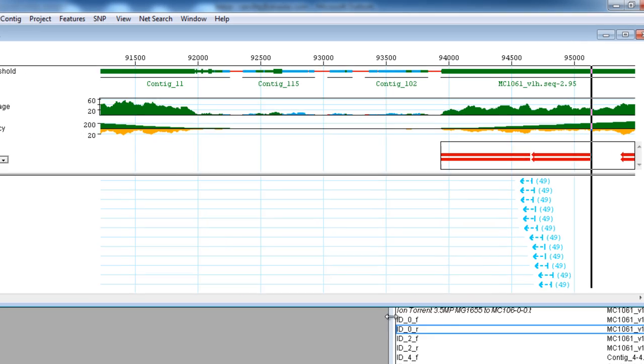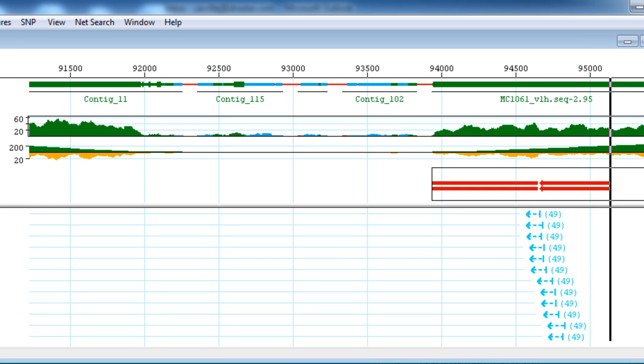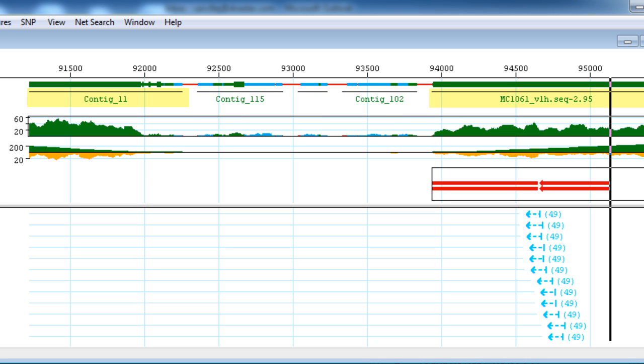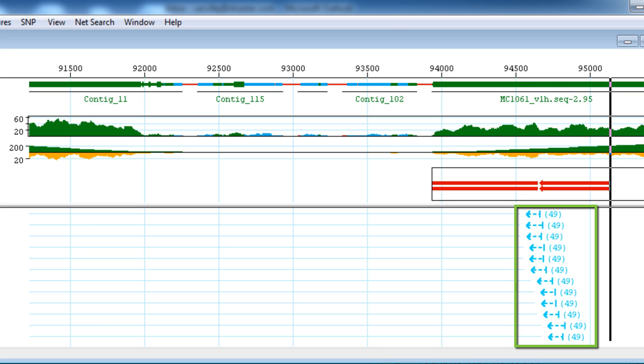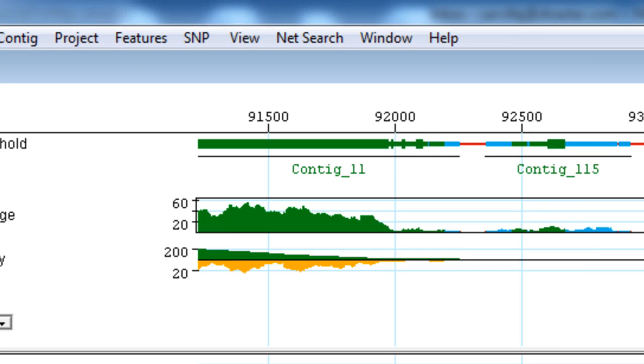If we look at the scaffold view before we align the contigs, we can clearly see 3 small contigs with very low coverage between contig 11 and this large MC1061 contig. The light blue arrows represent paired reads in different contigs within the scaffold. I will remove these 3 contigs to the unlocated contigs group, as demonstrated before with contig 85.